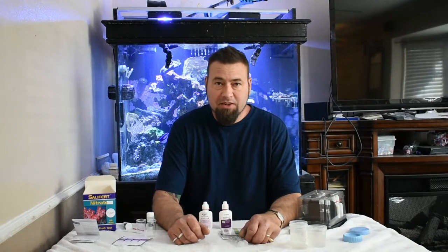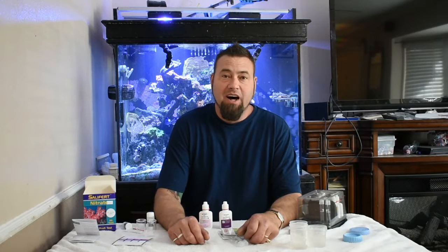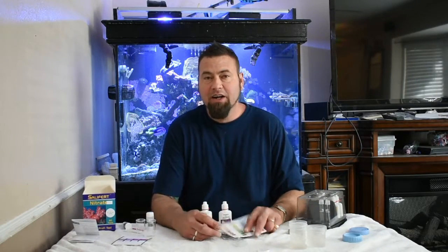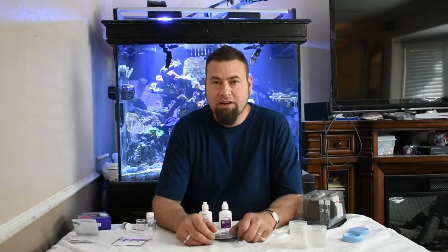Hey you cool cats and kittens — sorry, I couldn't resist. Anyway, this is Bruce here with Aquarium Life, and today I'm going to be comparing the less expensive API test kit with Salifert's test kit. Specifically today we're doing nitrate.